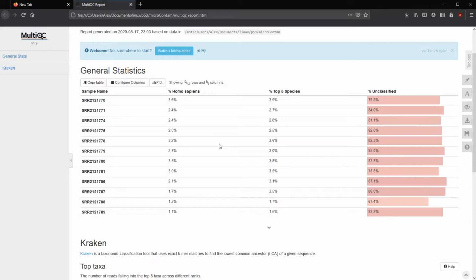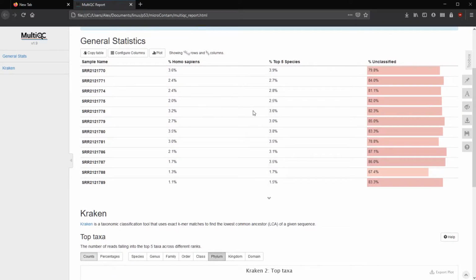And if we remember, these are the output files from STAR that didn't map when we used STAR. So these are already ones that didn't map to the mouse genome. So this is just double checking that we're not getting too much contamination, I guess.